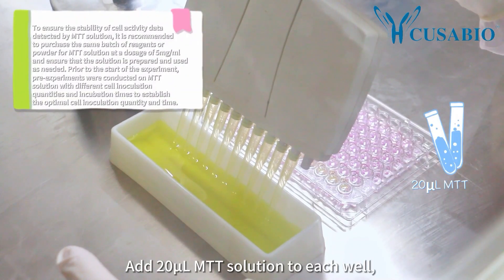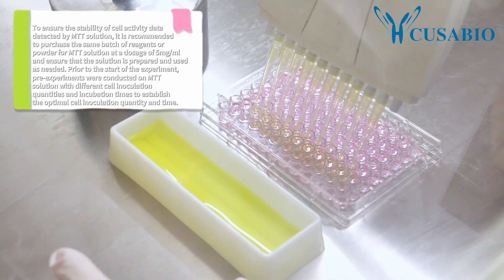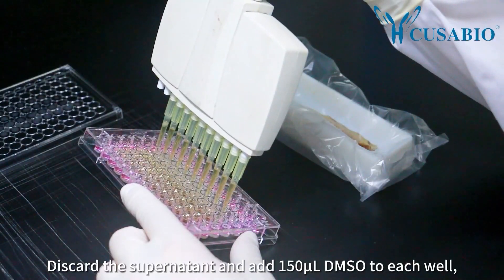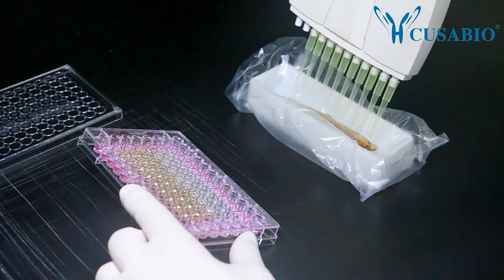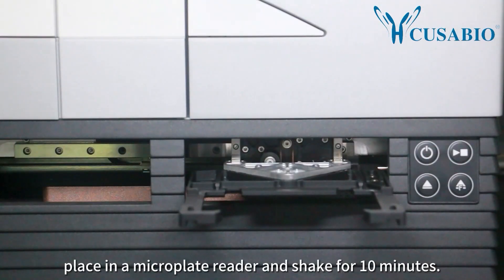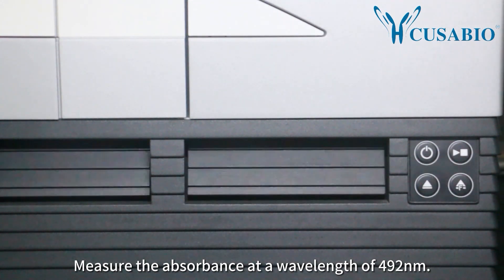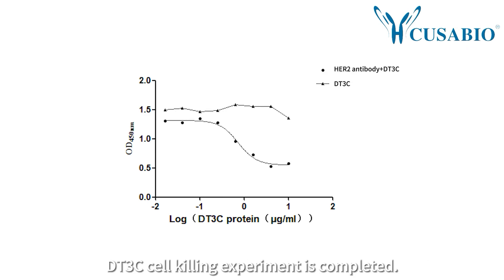Add 20 microliters of MTT solution to each well and incubate in a 37°C constant temperature incubator for four hours. Discard the supernatant and add 150 microliters of DMSO to each well. Place in a microplate reader and shake for 10 minutes. Measure the absorbance at a wavelength of 492 nanometers. The detection results of the DT3C cell killing experiment are shown in the figure.